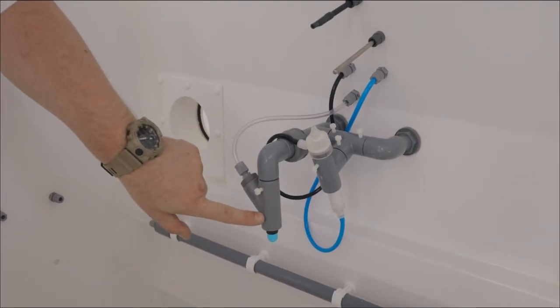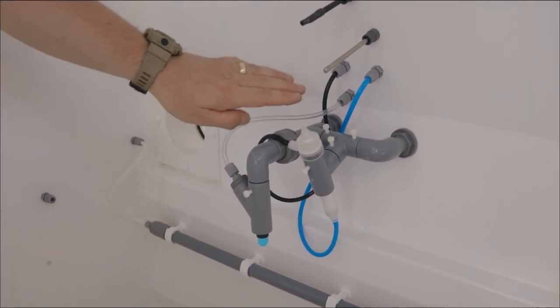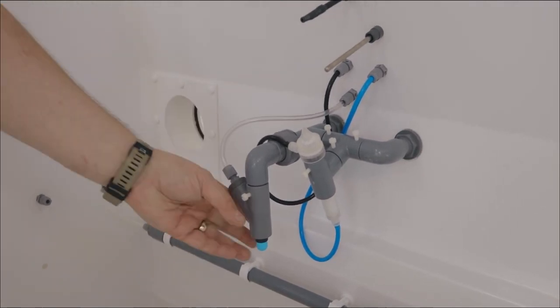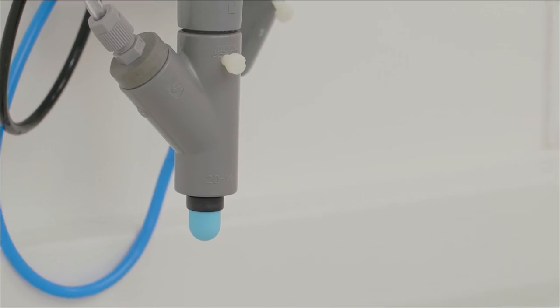We have a humidity sensor and protective air curtain. This is used to protect the delicate sensor during salt spray operation.